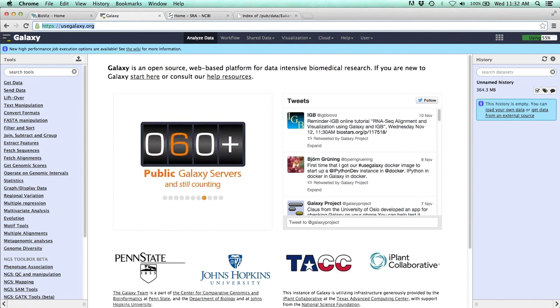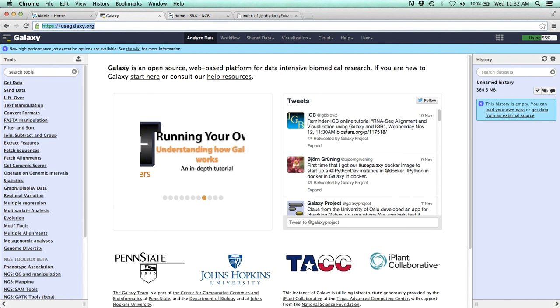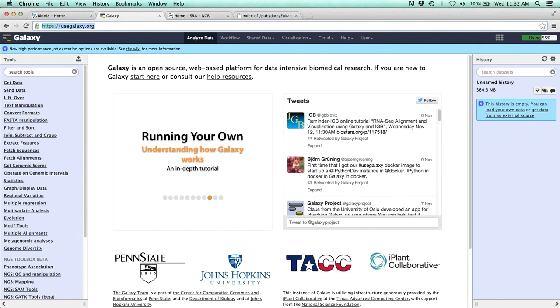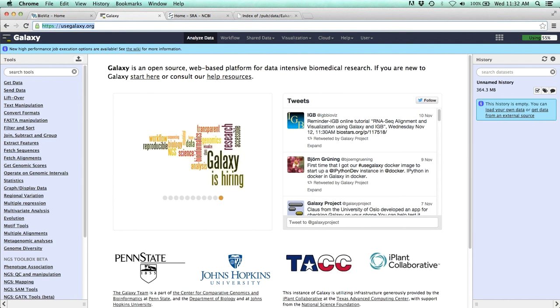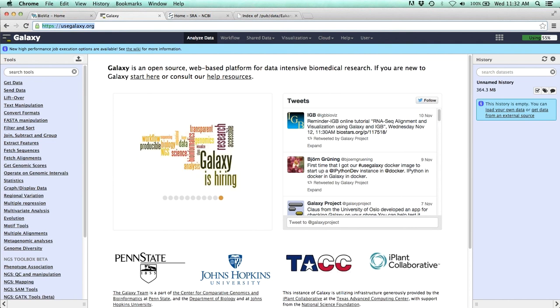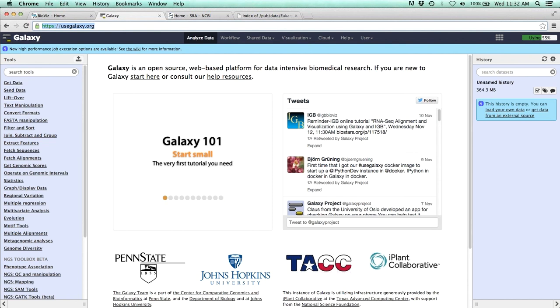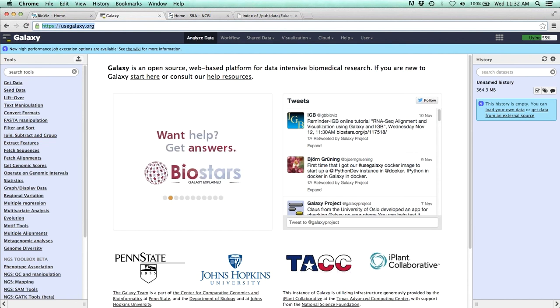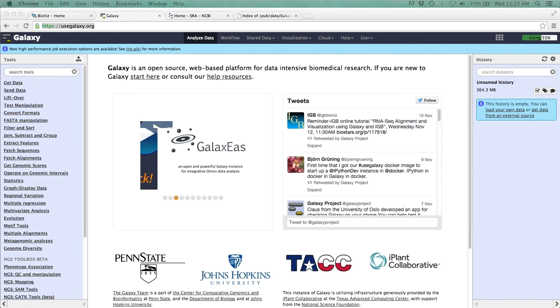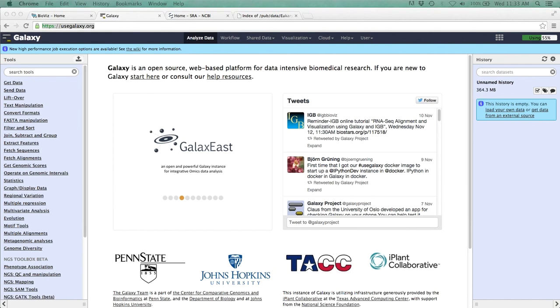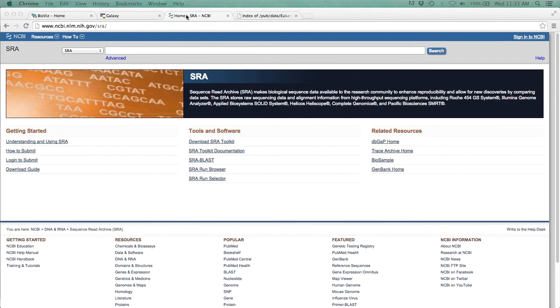For today's example scenario, I thought we could look at mining publicly available data and then create our own analysis within Galaxy. Alternatively, once we have this raw data, the workflow I'll demonstrate will be exactly the same if you had carried out your own experiment using RNA-seq and had just received those raw sequence data files. A good place to start searching for publicly available sequence data would be the NCBI sequence read archive or SRA.